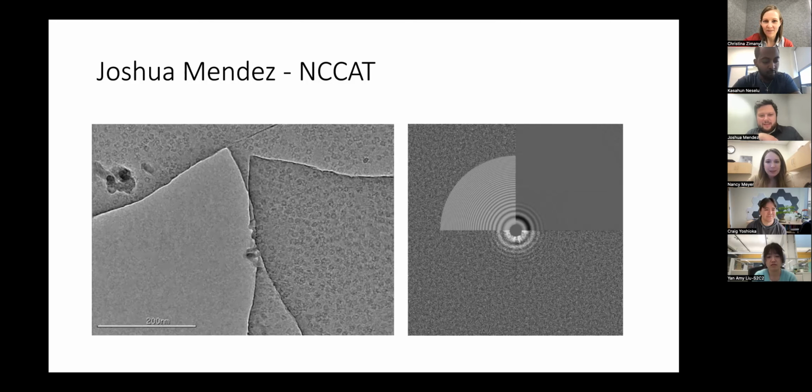So this is one of those micrographs that you would not expect to have anything useful, and which will still be problematic to process, although you can still probably pick some of the particles there and use them if you're in dire need. But I thought it was an interesting micrograph that I don't typically see. I usually see them flying out. But here you can see the 2 layers of ice and the particles on top of each other. So I thought it was fun.